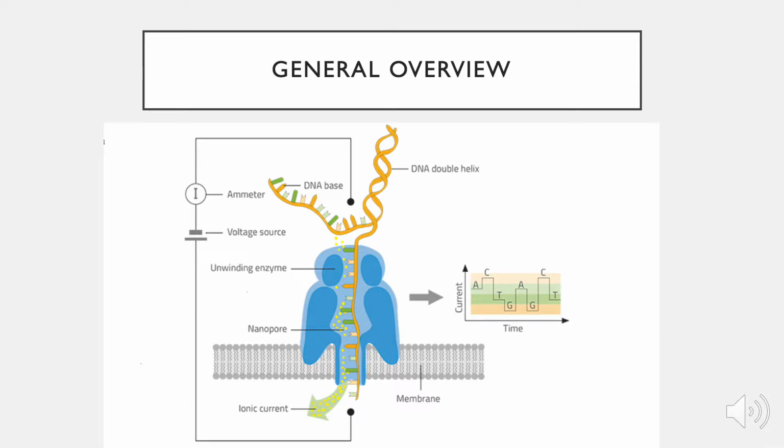In the Oxford platform, nanopores reside in a synthetic membrane that has a high electrical resistance. The membrane is submerged in an electrophysiological solution, allowing for the generation of an ionic current when a potential is applied across the membrane. The electrical resistant membrane ensures that the current generated only passes through the nanopore. When the DNA or RNA is pulled through the nanopore, the different combinations of nucleotides disrupt the current, and these disruptions can be measured to determine the sequence.